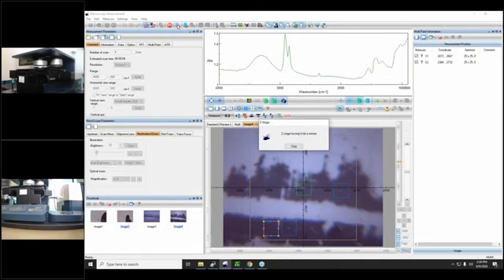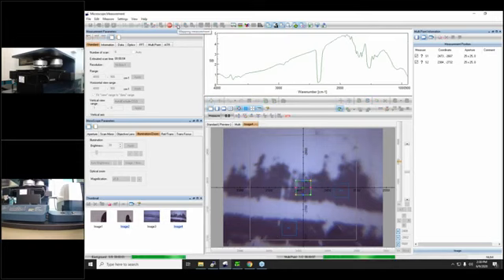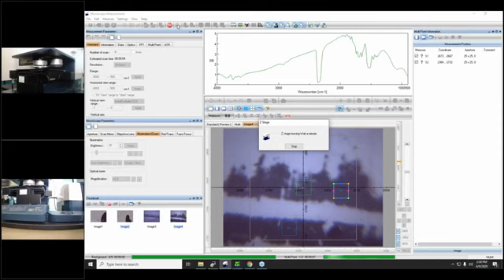So as I mentioned before, for every FTIR measurement, you have to have the background. So now the instrument is taking the background, and the background with the ATR is not in contact with the sample. Now the stage is raised again, because now we are going to measure the first sample.